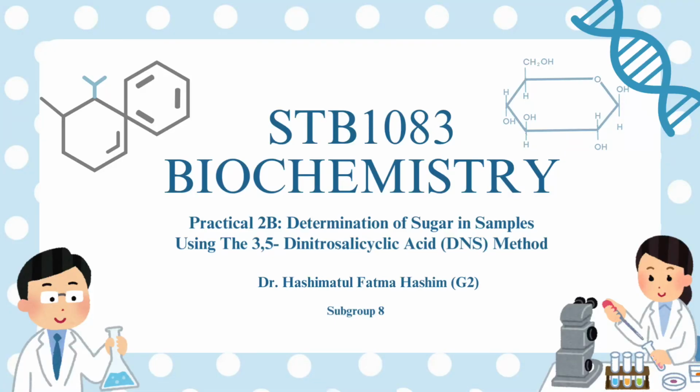STB 1083 Biochemistry Practical 2B: Determination of sugar in sample using the 3,5-dinitrosalicylic acid DNS method by subgroup 8.